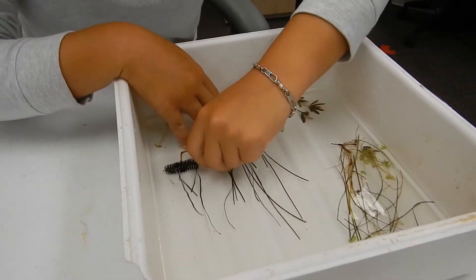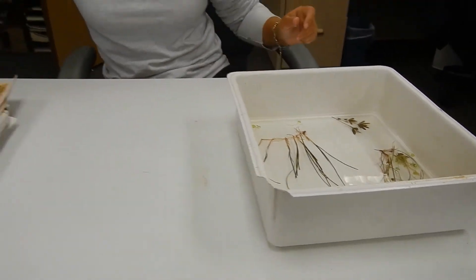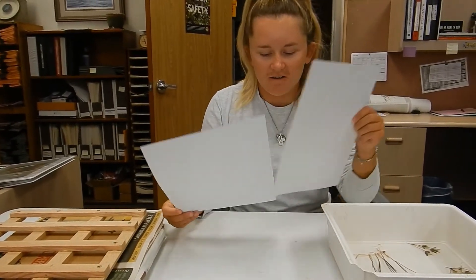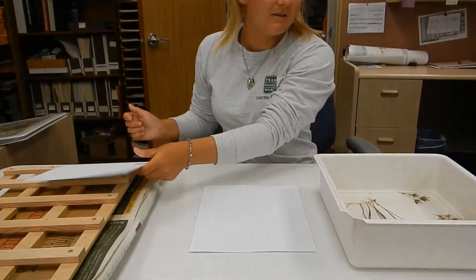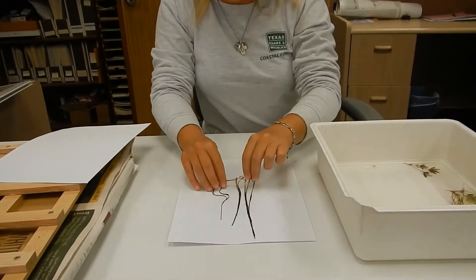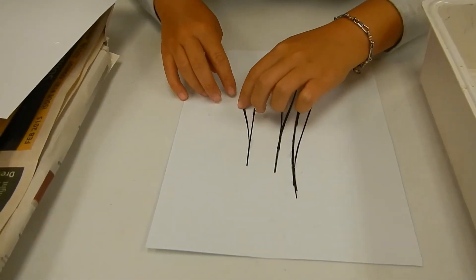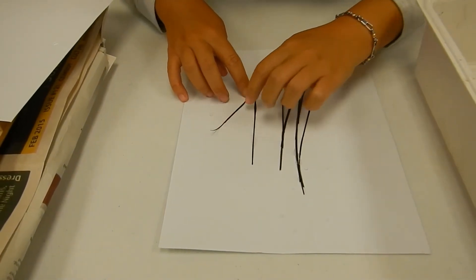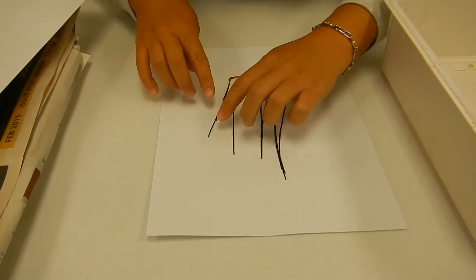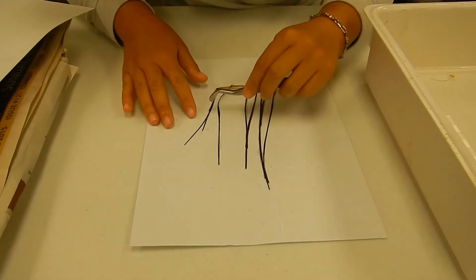Once you think you've gotten it clean enough, you're going to take some thick paper — I have cardstock here. I'm going to lay this piece out and take the sample and put it on the paper. Now we just want to separate it out and get it looking like it did when it was still in its environment, so I'll take some tweezers and try to separate them.